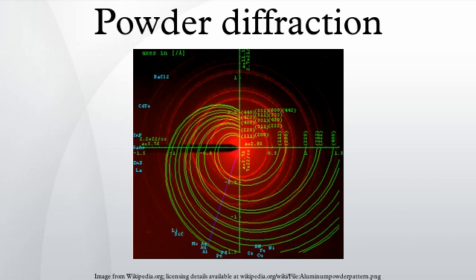For aperiodically arranged clusters, predicting the scattered intensity and powder diffraction patterns from gases, liquids, and randomly distributed nanoclusters in the solid state is done rather elegantly with the Debye scattering equation, where the magnitude of the scattering vector Q is in reciprocal lattice distance units. N is the number of atoms, φ_i(Q) is the atomic scattering factor for atom i and scattering vector Q, while r_ij is the distance between atom i and atom j. One can also use this to predict the effect of nanocrystallite shape on detected diffraction peaks, even if in some directions the cluster is only one atom thick.